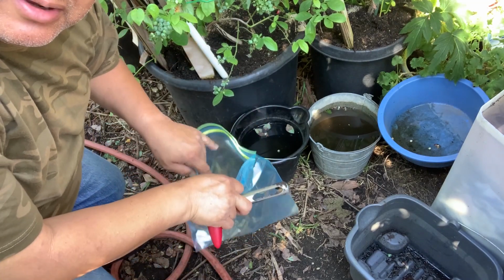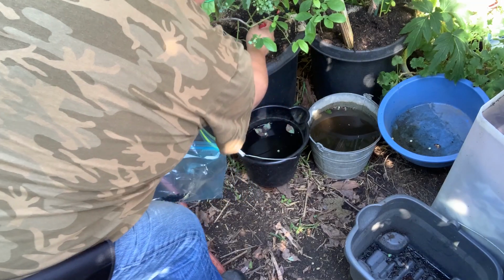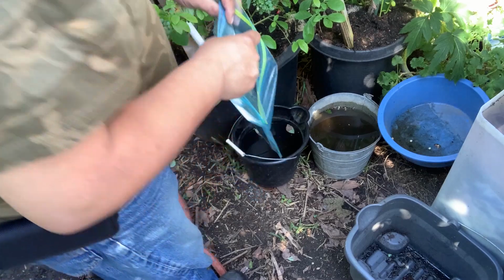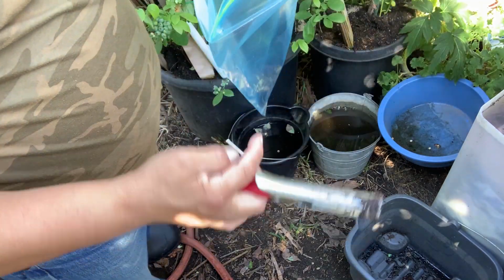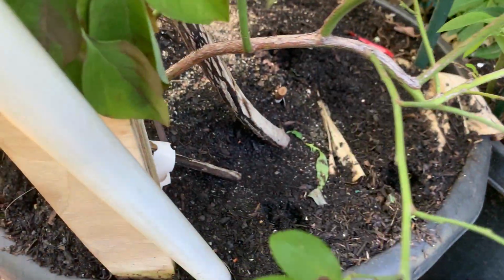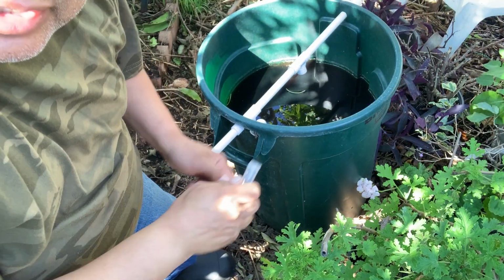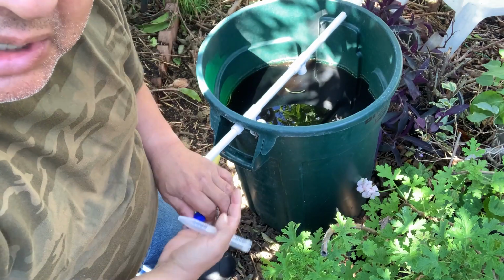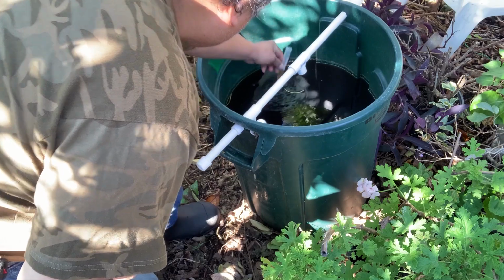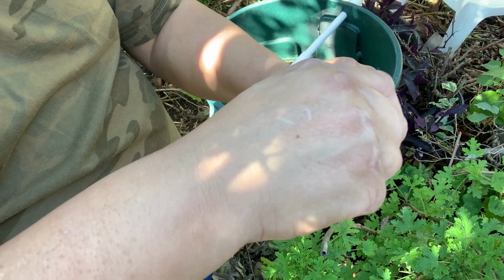Okay, we're gonna take our second sample here from the blueberry. Okay, you don't need that much. So here we are, this is the blueberry. Okay, next sample is going to be the water. Remember, I'm making this microorganism brew here. So we're going to take some. That's about all that we need. And we're going to see what kind of micros we're making.